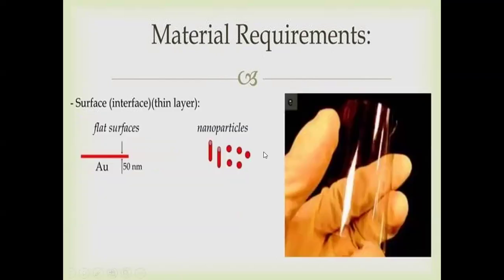And the thickness of this metal film when you make it is very, very small, in the range of 50 nanometers, very thin. Only then will the metal ions be in the resonance form when the incident light is reflected on them. And sometimes we use nanoparticles because the specificity and the amplification of the signal will be many fold higher when you are using nanoparticles. And sometimes the cost of the sensor can be reduced by using a nanoparticle-based synthesis.